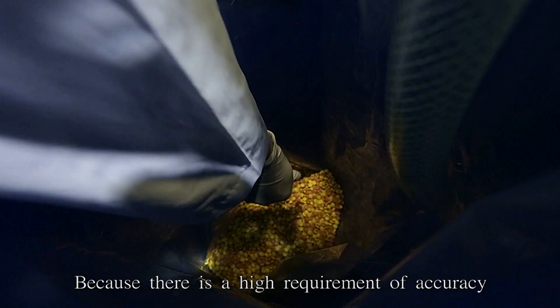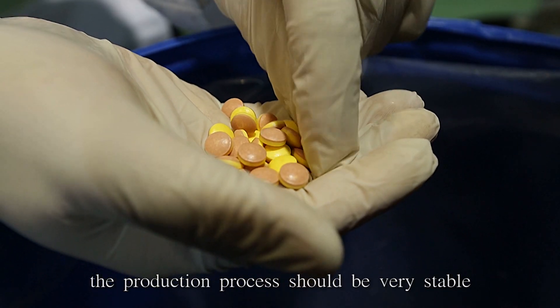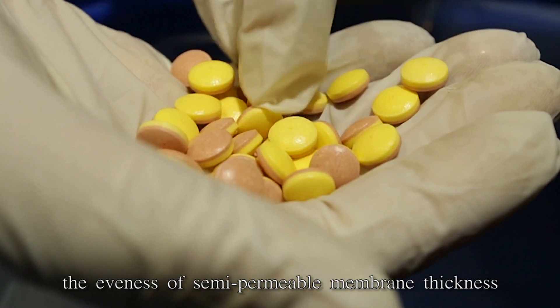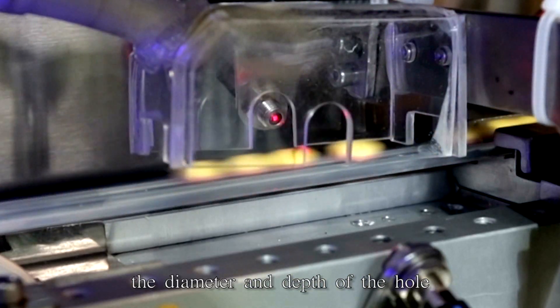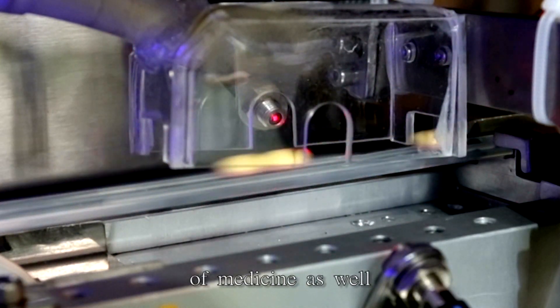Because there is a high requirement of accuracy for controlled release types of medicine, the production process should be very stable. Furthermore, the weight, the evenness of semi-permeable membrane thickness, the diameter and depth of the hole will all influence the release speed of medicine.